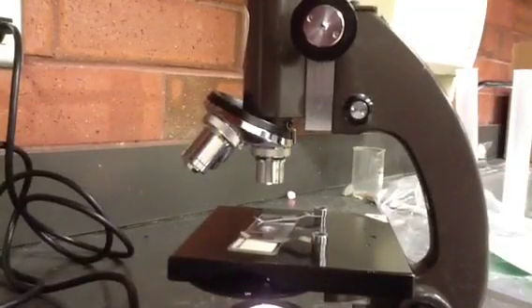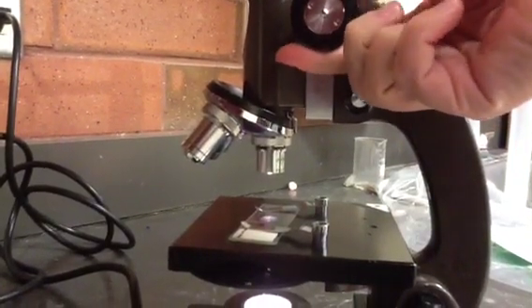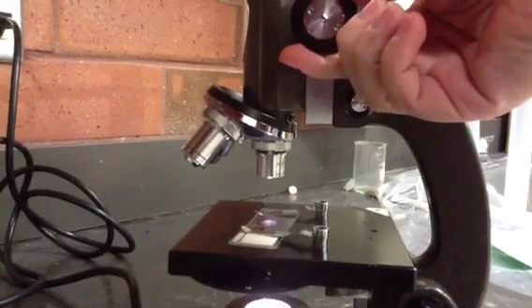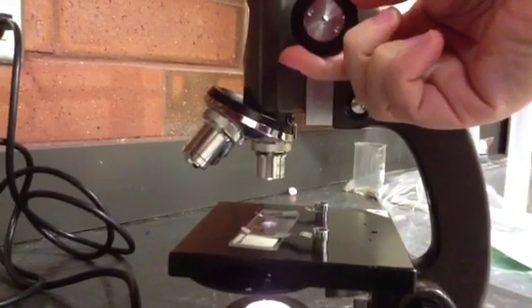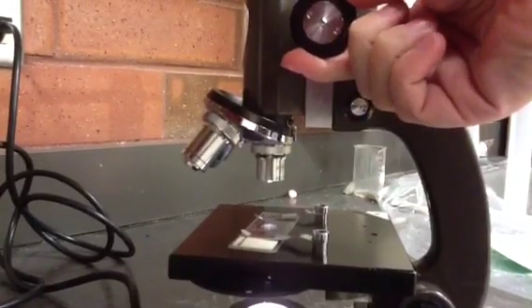Your next step is to start focusing your microscope. Using the coarse adjustment knob, turn it so that your lenses are as close to the slide as they can get. Remember, stop when the knob doesn't want to turn anymore, otherwise you'll break the microscope.